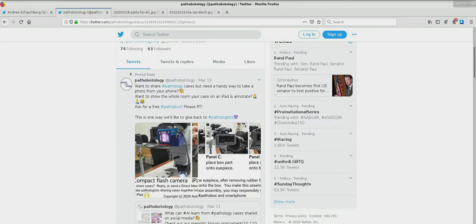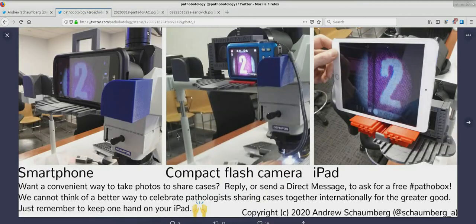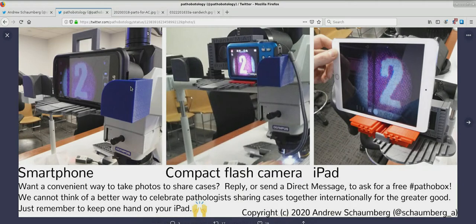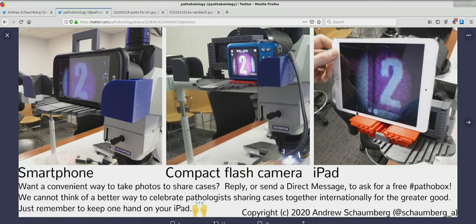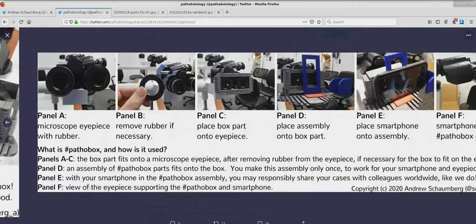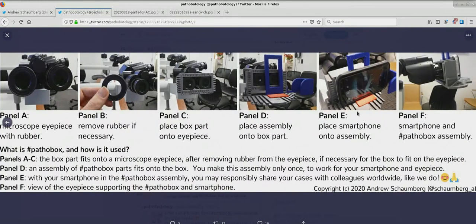Pathobox is a system of 3D printed parts that accommodate a variety of imaging devices on your microscope eyepiece. These devices can be a smartphone, a camera, or an iPad. This allows you to take pictures and videos to share with colleagues and discuss.